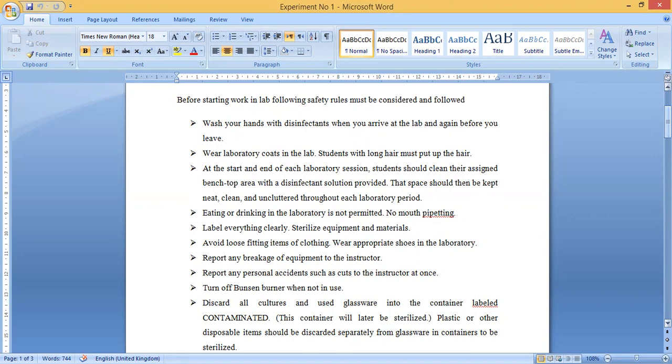Then wear the lab coat — a proper, neat, and clean lab coat covering your whole costume must be worn. Students with long hair must tie it up and cover their hair properly with a cap. If you are wearing a dupatta, hijab, or scarf, your hair should be tied properly and covered. This is the second important step: wearing the lab coat and covering your hair.